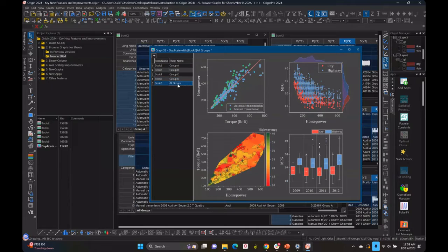So this way, I can navigate across sheets and see how my data changes as a function of whatever metadata parameter I want to explore with. And again, here, the same concept. I can do flip throughs, and I can also create a video if I wish to. Okay?